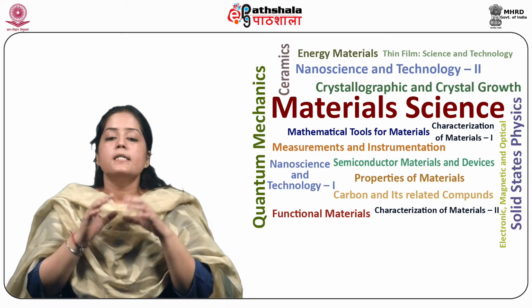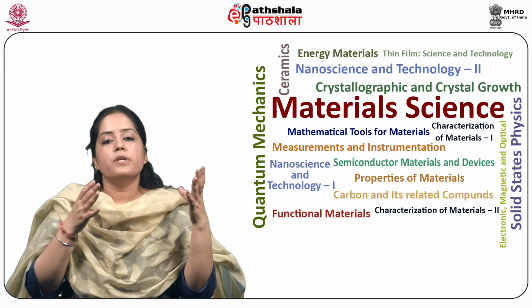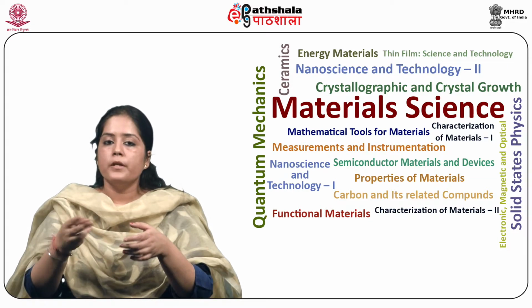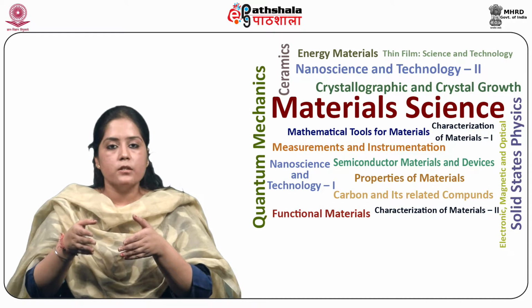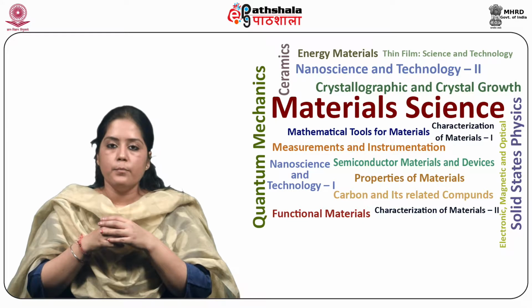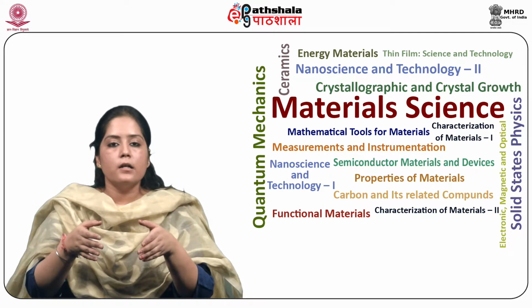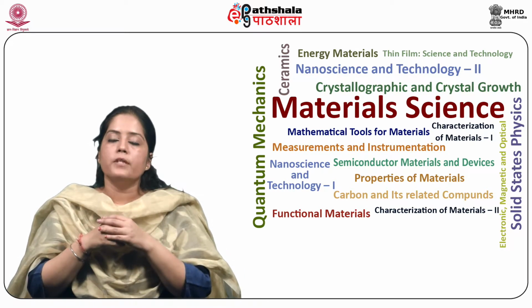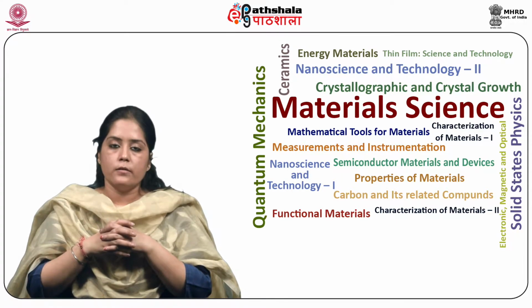Number one, techniques based on energy transfer between photon and a sample. Number two, reflection, refraction, diffraction, dispersion or scattering from the sample, altering the amplitude, phase angle, polarization or direction of the propagation of electromagnetic radiation.